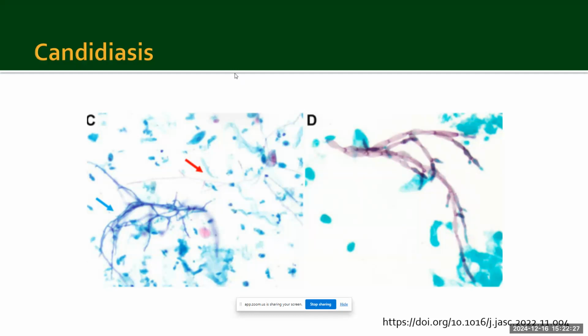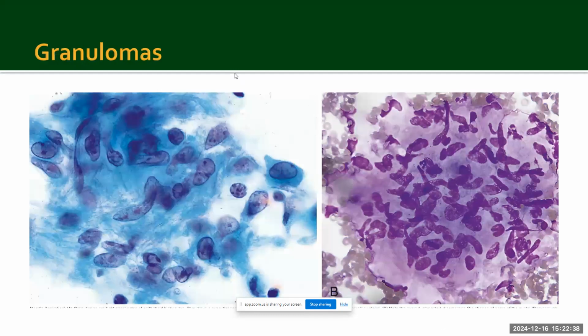But I do not disregard them, just because they are candidiasis, because there are some clinically infectious candidal species as well. Another thing to keep in mind are the granulomas.